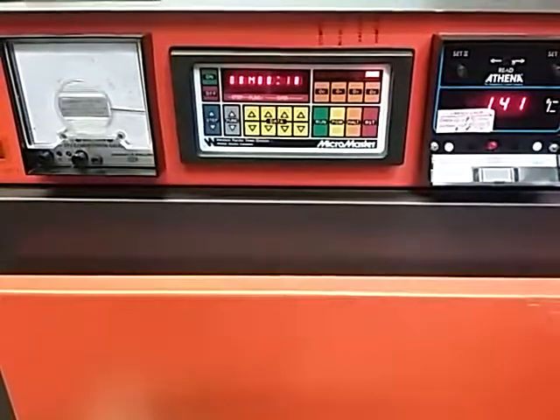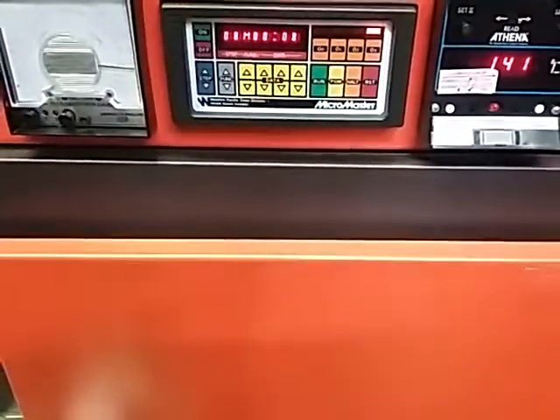Now we're in HMDS mode. You can see the indicator over here. And that's it.